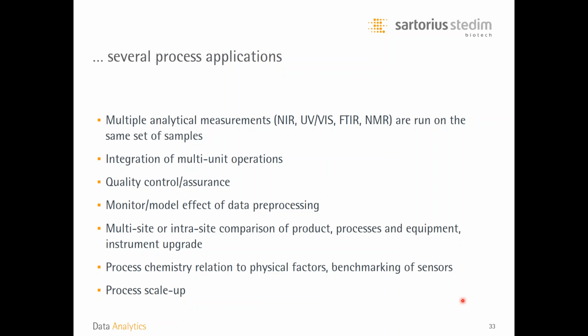And then that will form the Y block, and then you can compare the X and Y using the OPLS tool to find out if you're inducing some systematic variations to the filtered spectra following the spectral preprocessing technology that you are using. On the other hand, if you have a very high overlap in terms of the joint variabilities, then you're not inducing other systematic variations among the spectra.